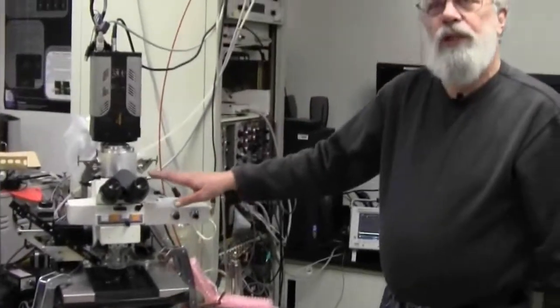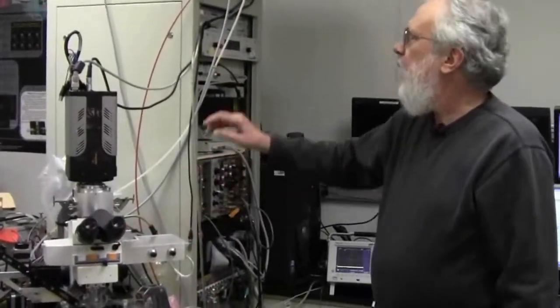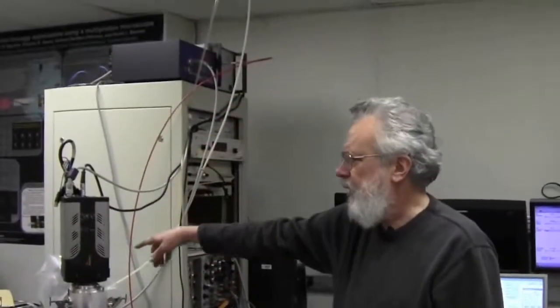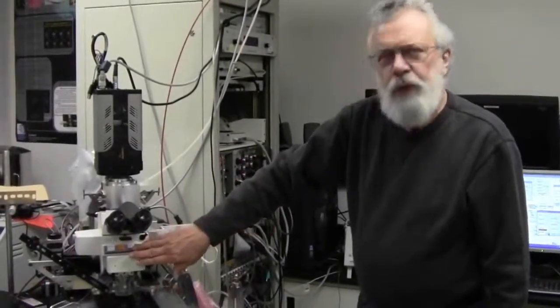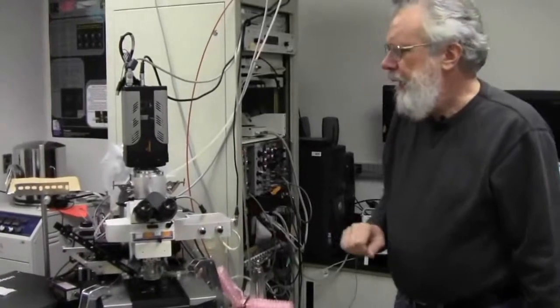The microscope is an epifluorescence microscope. We have a lamp with a fiber optic guide to bring the light into the microscope. We have a choice of cubes depending on what fluorochrome we're looking at.